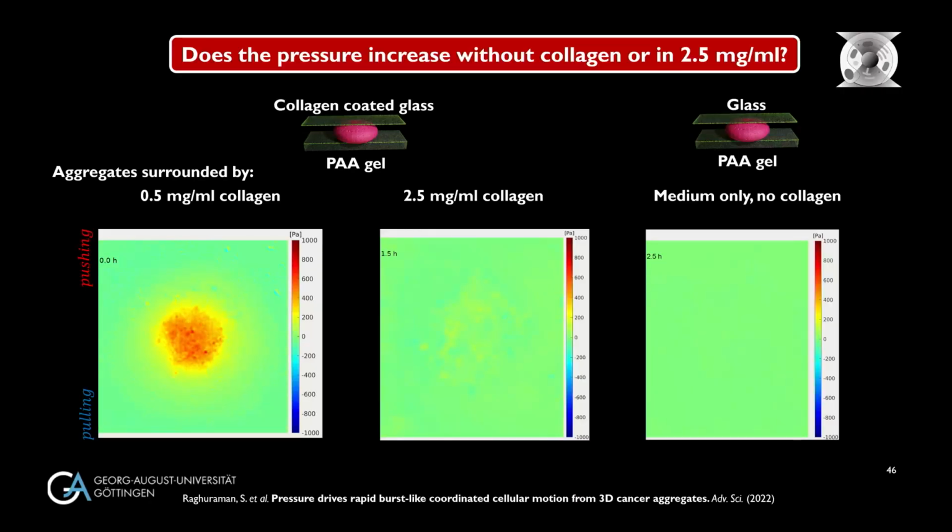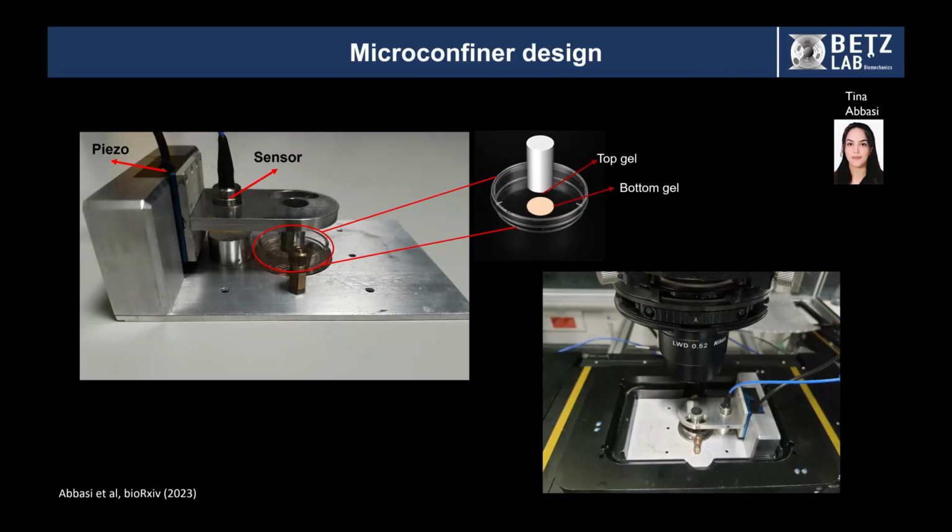So that basically suggests that really have just an increase in pressure that is provoked by the volume increase. We can talk later about where that comes from, but this is maybe a less exciting final outcome, but it shows quite nicely how you can really use physics, imaging, and a systematic approach here to understand something about the forces driving these systems.